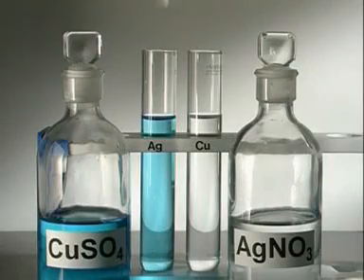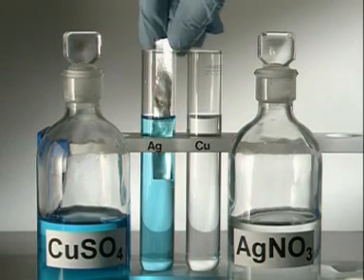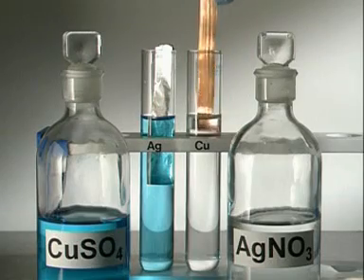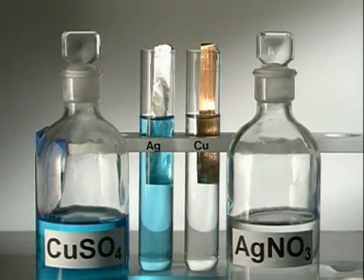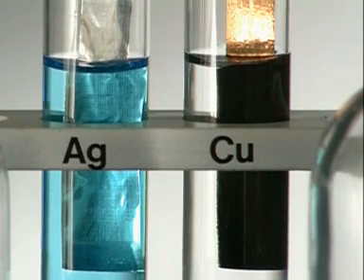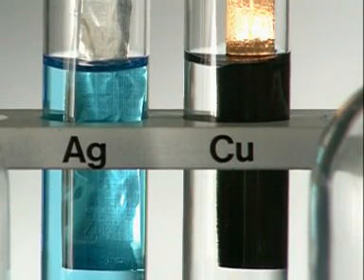But which is the least reactive? Silver is placed in a copper solution, and copper in a silver solution. The silver strip doesn't react, but the copper immediately displaces the silver.